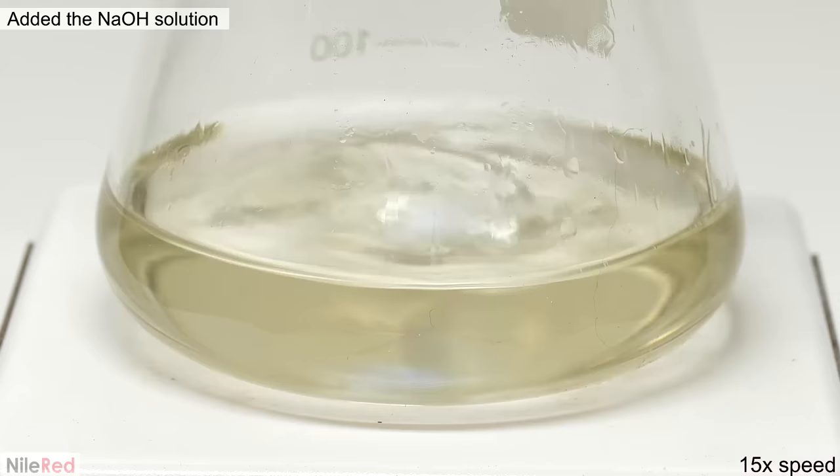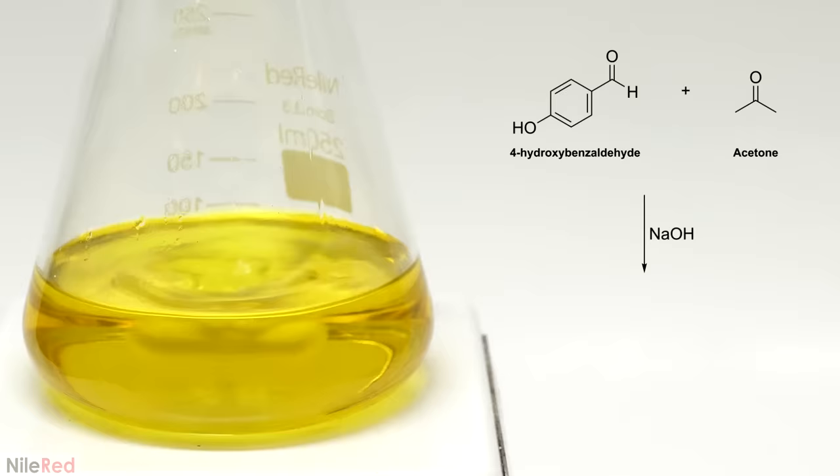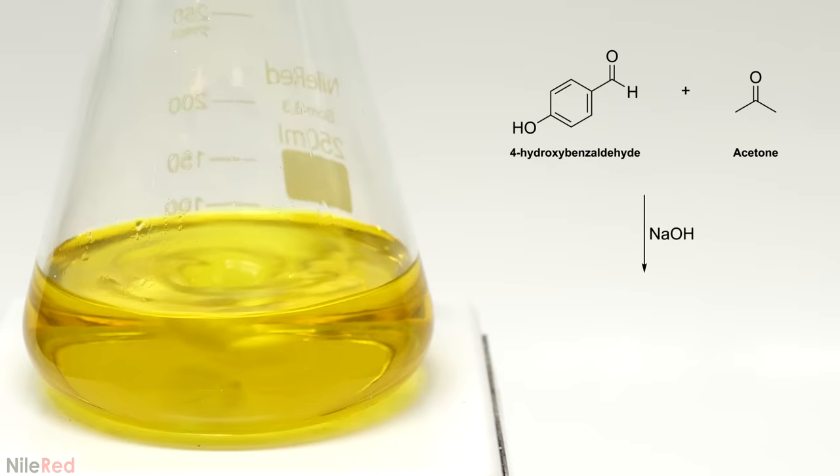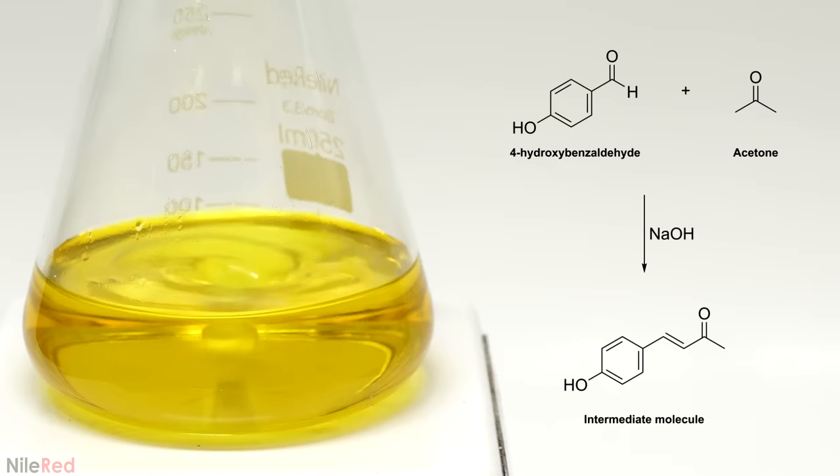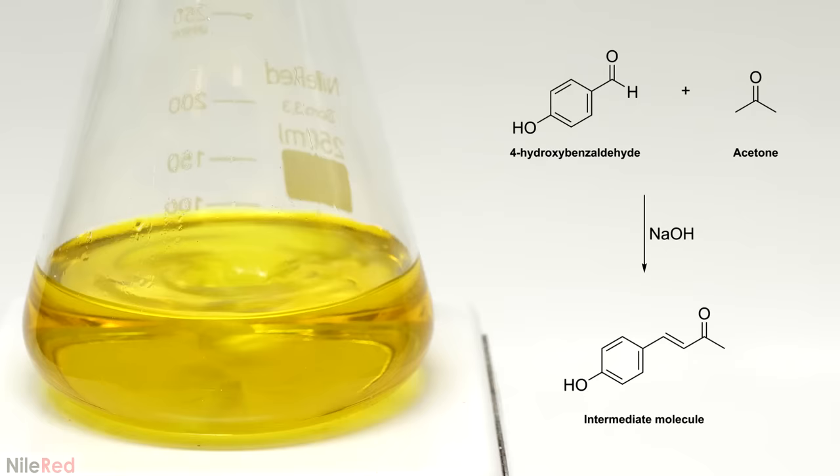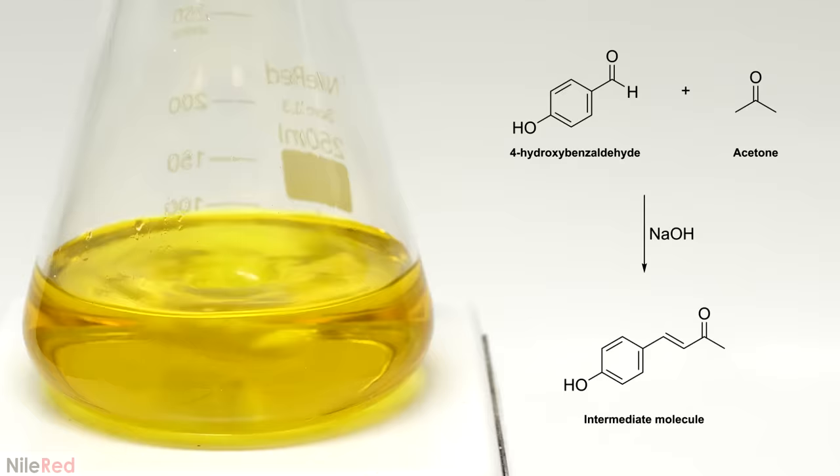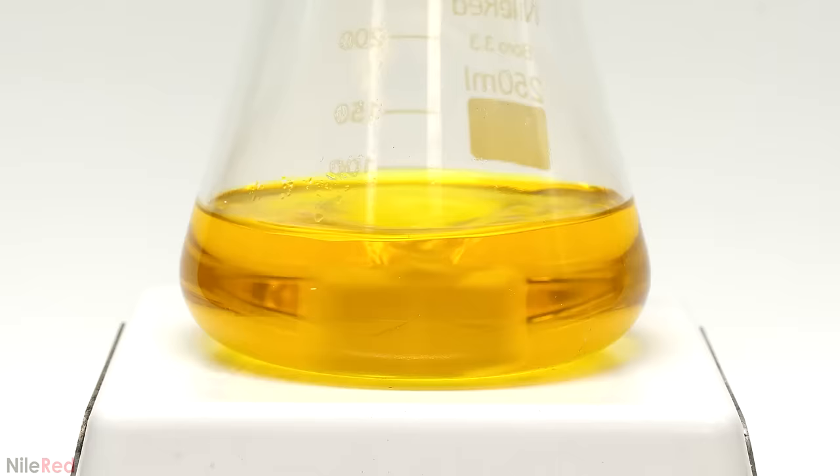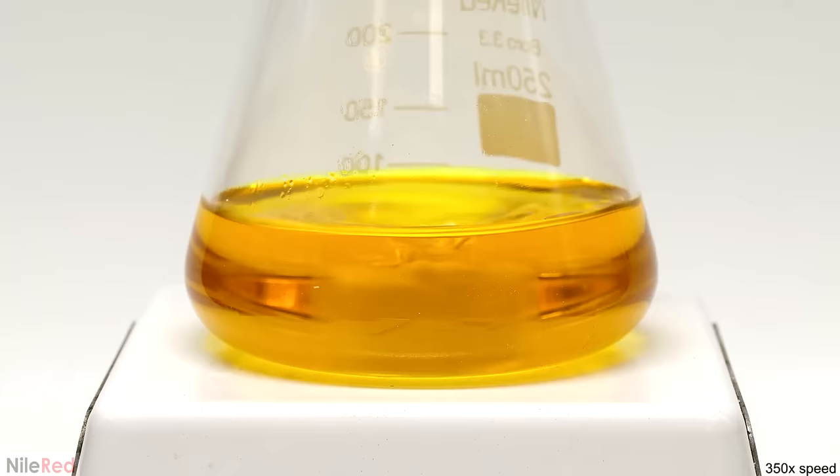Now the next step was with strong stirring to slowly add the sodium hydroxide solution. This caused its color to slowly change and by the time it was all added it had turned yellow. What's going on here is a reaction between the acetone and the 4-hydroxybenzaldehyde and it's catalyzed by the sodium hydroxide. This reaction is generally known as an aldol condensation and a new carbon-carbon bond is forming between the two molecules. The result is this intermediate molecule which is actually very close to the final raspberry ketone. However, it still has this double bond which I'll have to get rid of with another reaction.